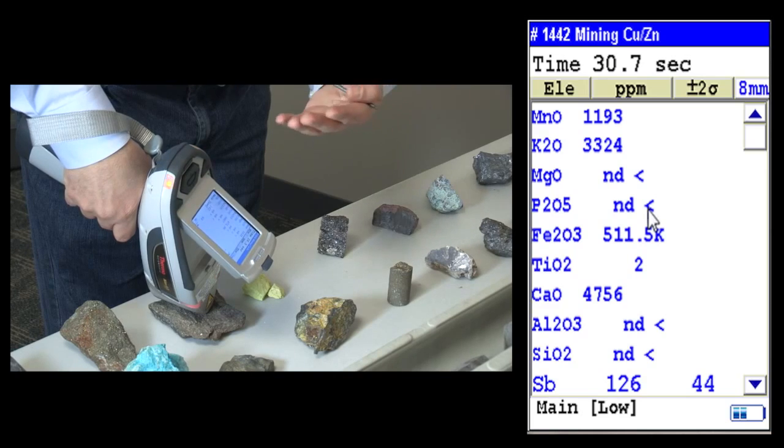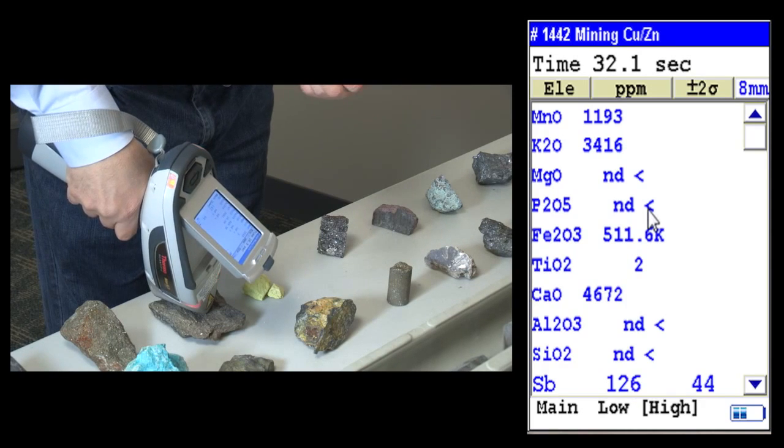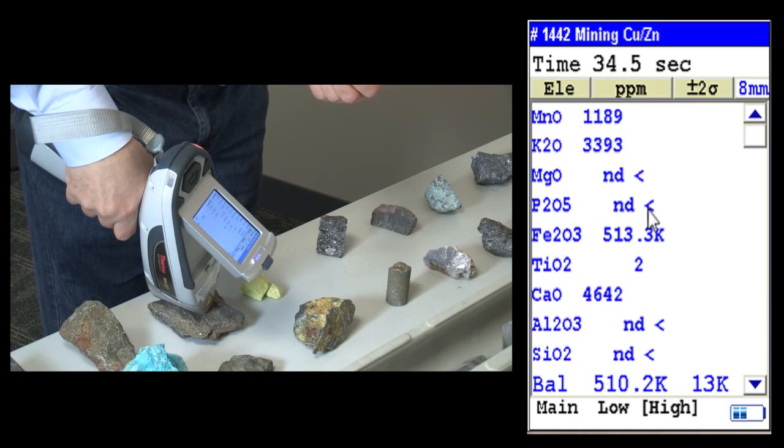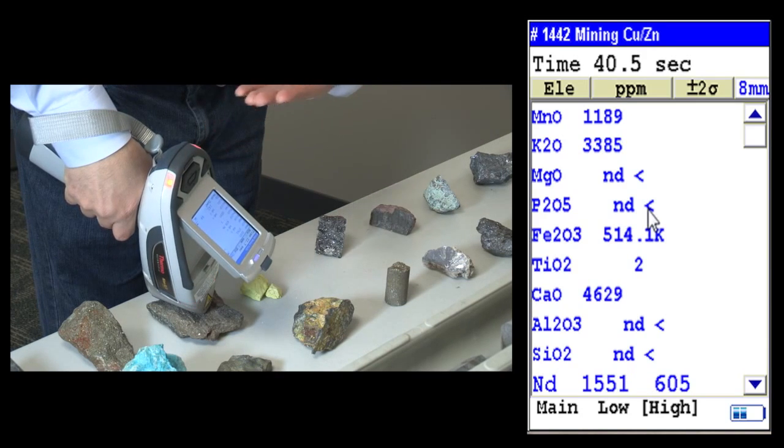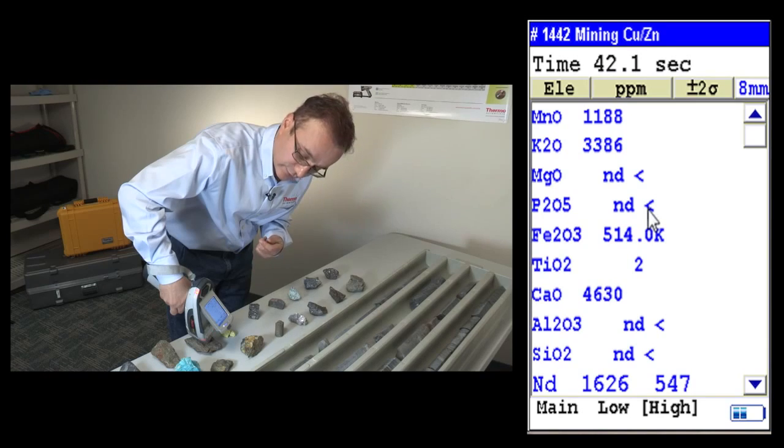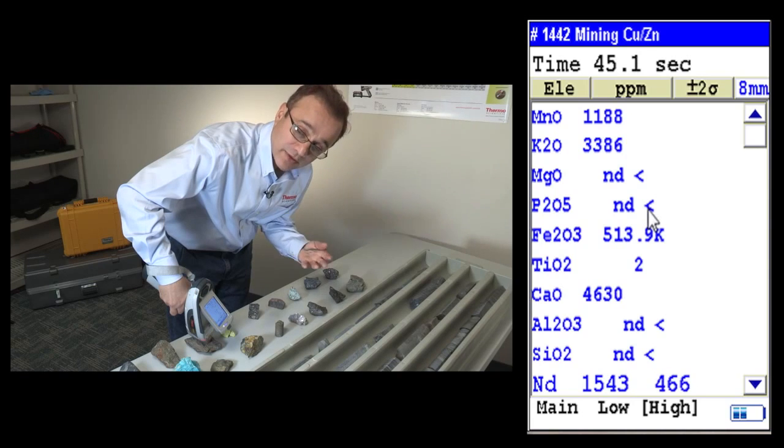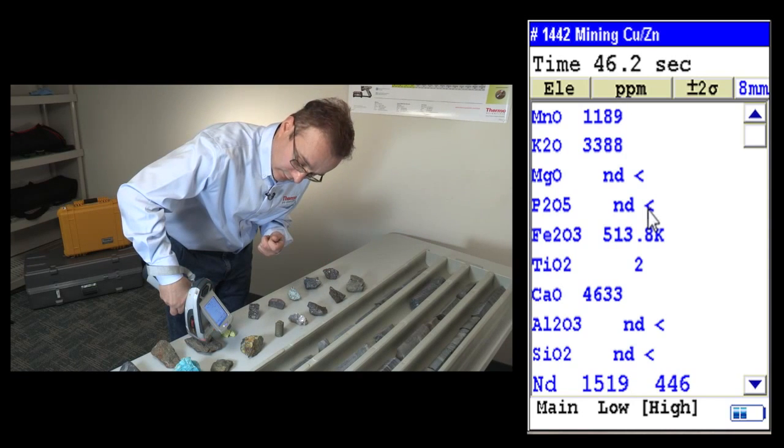You can choose to show your major elements as oxides. It has a feature called Sodo Elements where you can give the formula and the software will calculate your element based on the formula entered to the system.